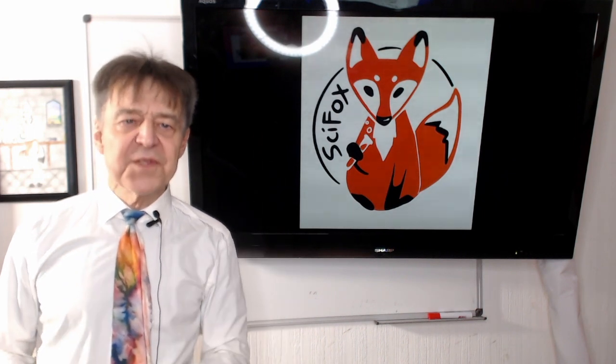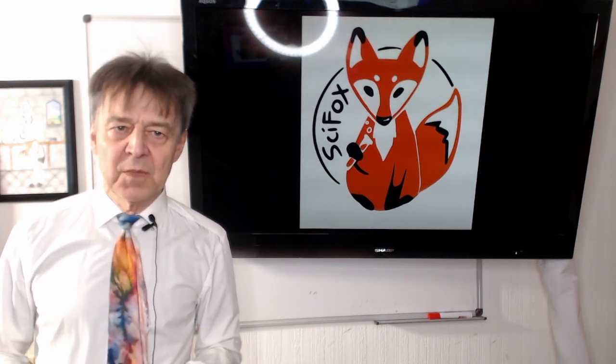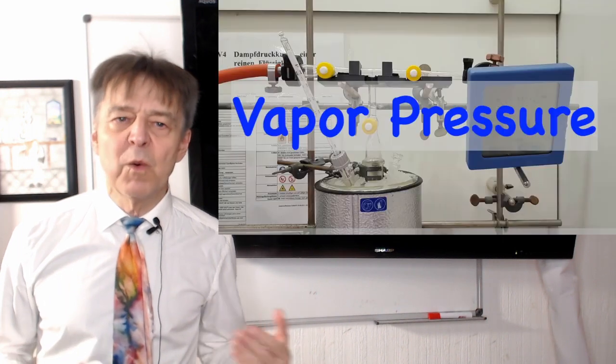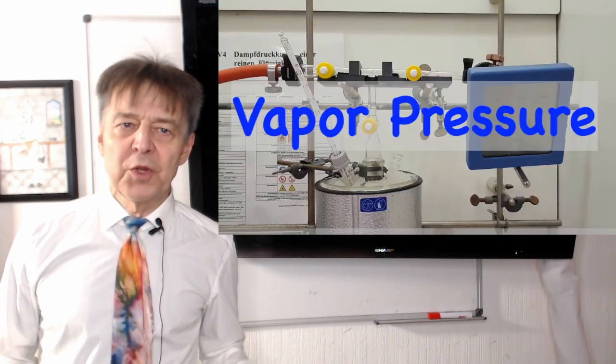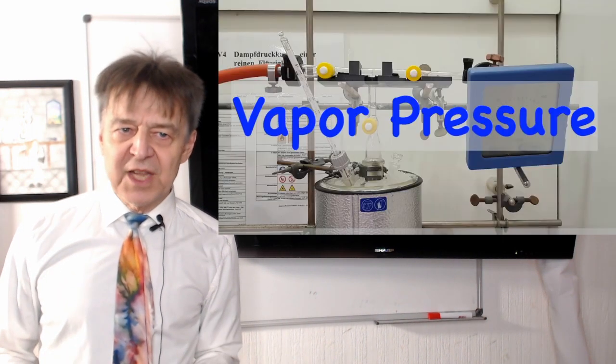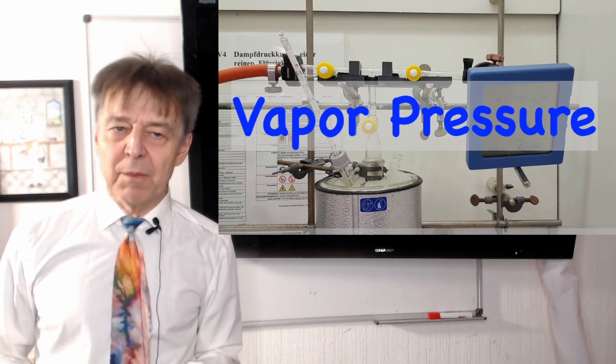Hello and welcome to Physical Chemistry Laboratory. Today's topic, vapor pressure. We want to determine the heat of vaporization using vapor pressure measurements.